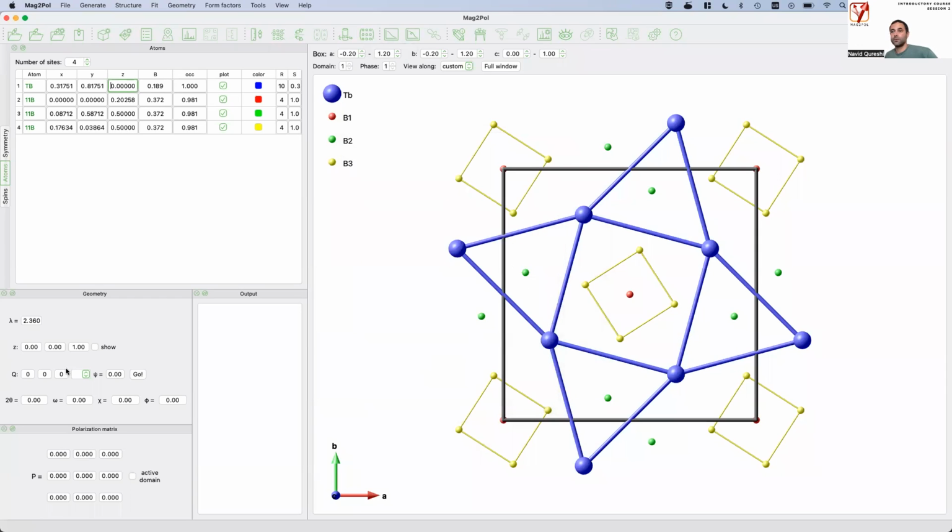So first thing you can do is you can type some random HKL reflection, click go. So we've seen that last week. You can calculate nuclear and magnetic structure factors, but the program will also calculate the diffractometer angles, how the angles and motors have been rotated to put your single crystal in diffraction position.